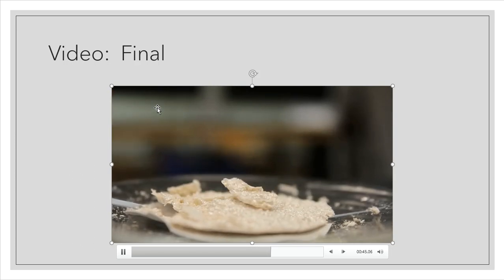So I'm going to take these melting point tubes and I'm going to load up 3 melting point tubes and I'm going to take them over to our melting point system. Excuse me, and we're going to get a melting point of these crystals to see if we have made the cis version or the trans version.